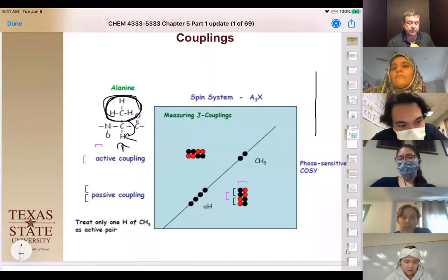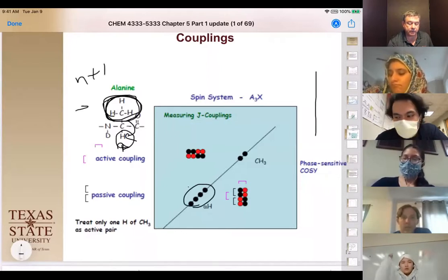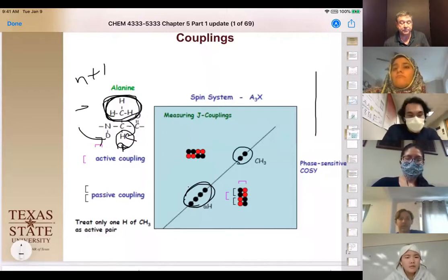And this hydrogen here is unique and only splits those. So we end up with our 3 peaks, which is our N+1 for splitting of this right here. It gives us a total of 4 peaks here. And our N+1 for these 3 all being the same, split by 1, gives us these 2 peaks for that.